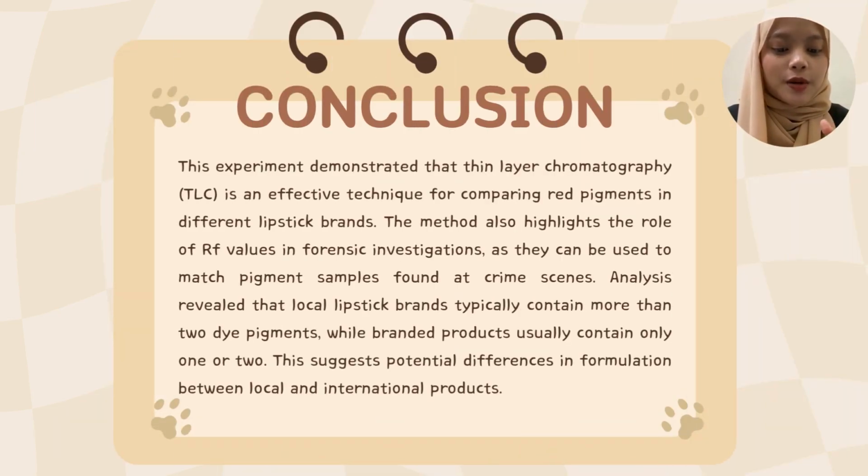Conclusion: this experiment demonstrates that thin layer chromatography (TLC) is an effective technique for comparing red pigments in different lipstick brands. The method also highlights the role of RF value in forensic investigation, as they can be used to match pigment samples found at a crime scene.